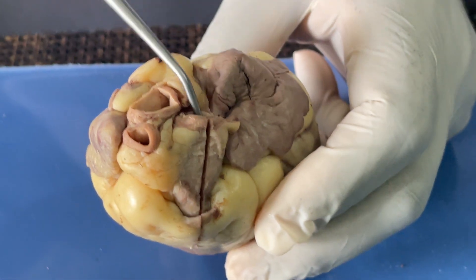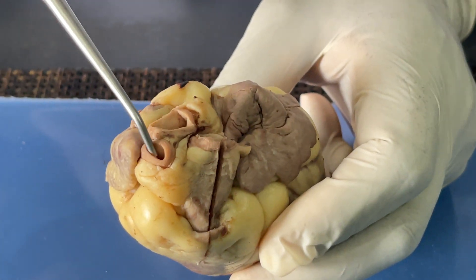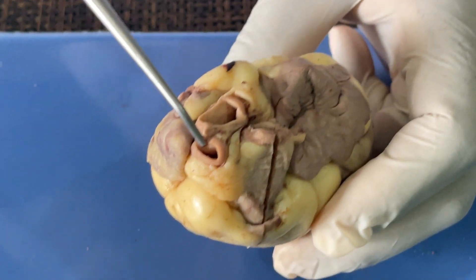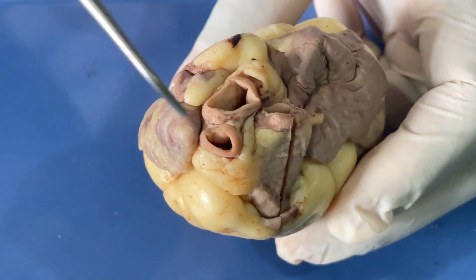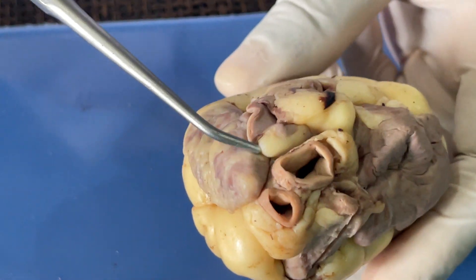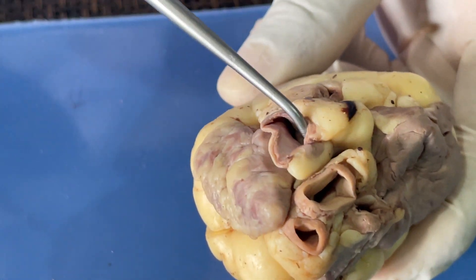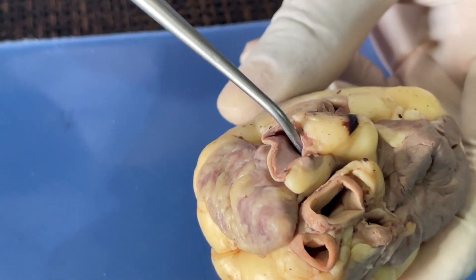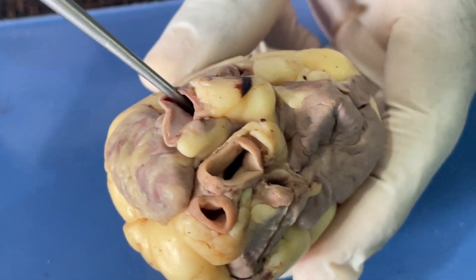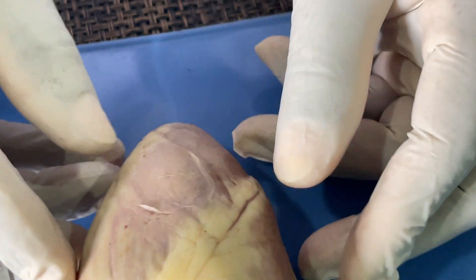From here we can observe the aorta — this is the aorta here. Then the pulmonary trunk is also here. Then we have the brachiocephalic trunk, which is actually a branch of the aorta that splits into two to form the subclavian artery and then the common carotid artery. When we come to the right side, we have this trunk here — that is the superior vena cava, which brings blood into the right atrium.